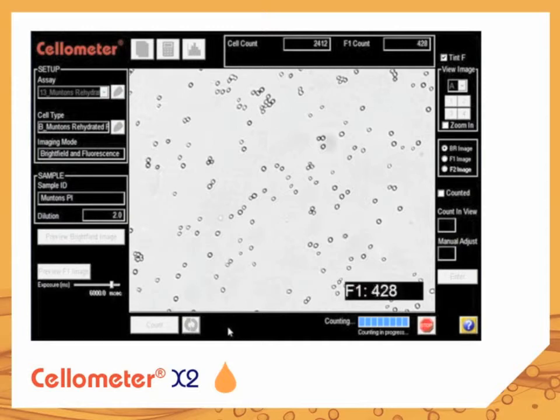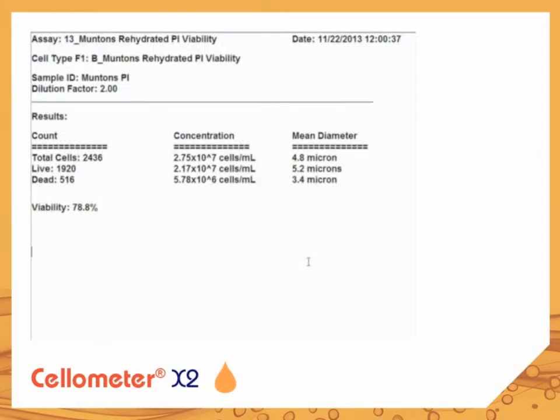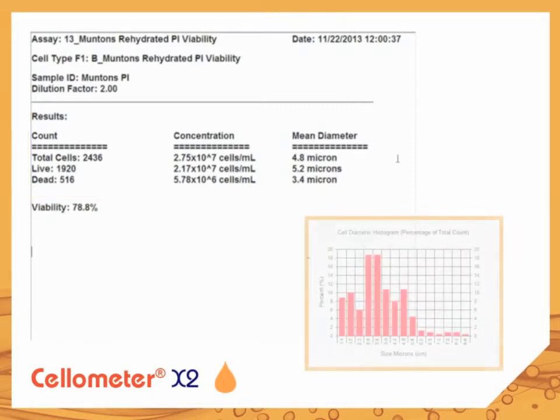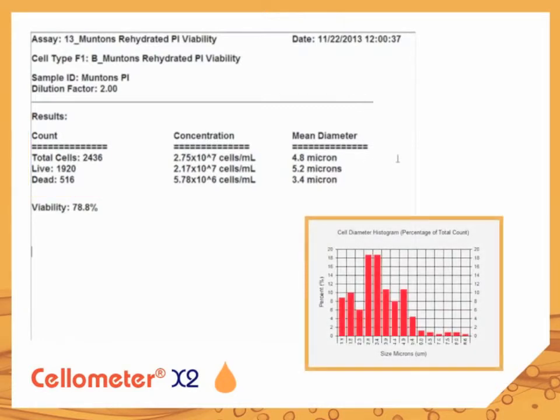After cell images are acquired, results are displayed on the screen. Results include the total count, cell size histogram, percent viability, and concentration.